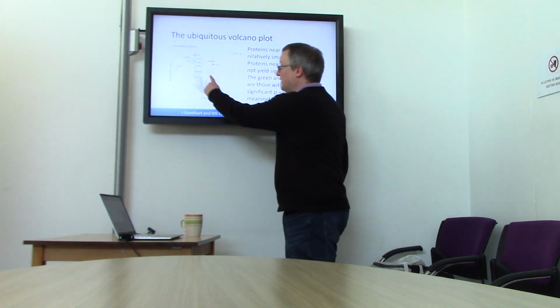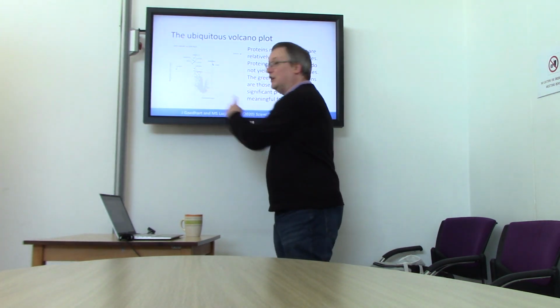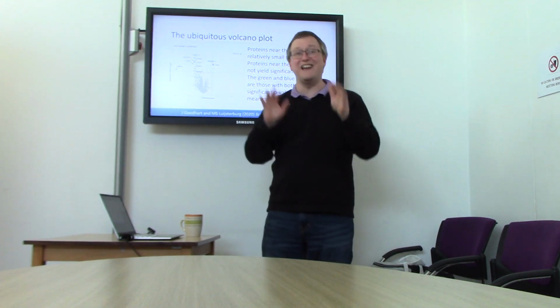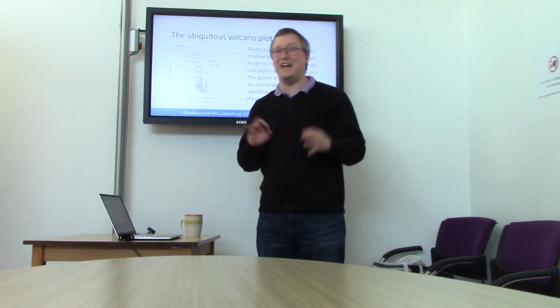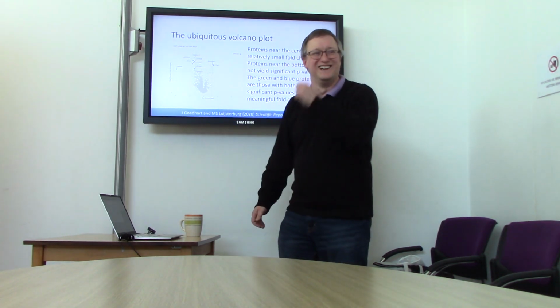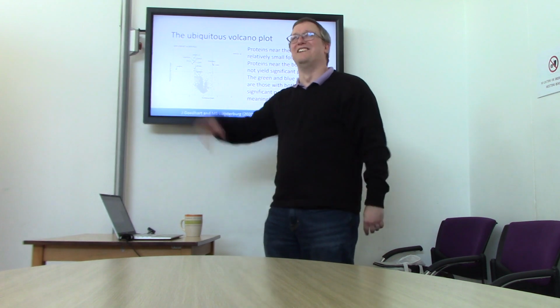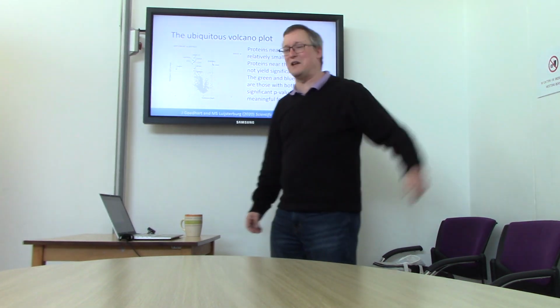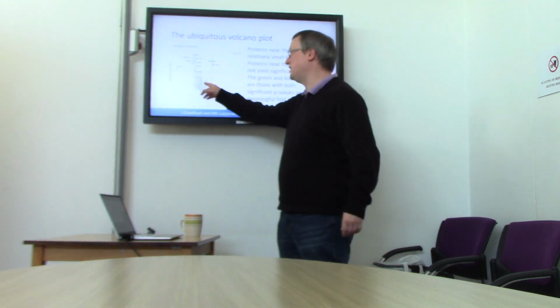Okay? So this most popular part of the volcano plot, the bottom center section, is the set of proteins that neither had a good p-value nor did they have a big fold change. This is the land of lost toys here, right? This is the, I don't know, the stuffed animal that you have stuffed in your closet somewhere and really should have gone into a dumpster many, many years ago.